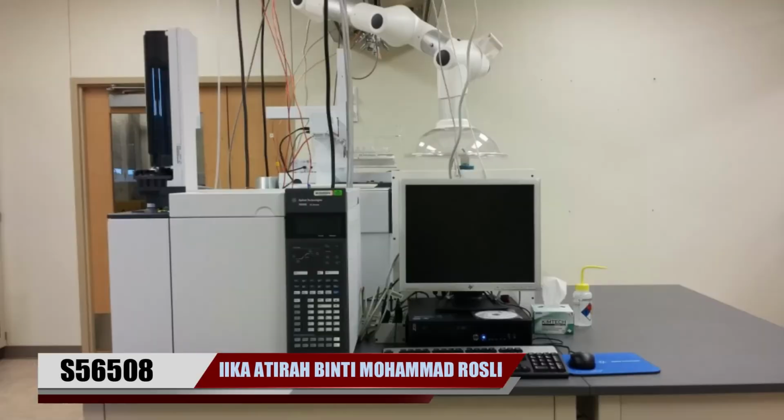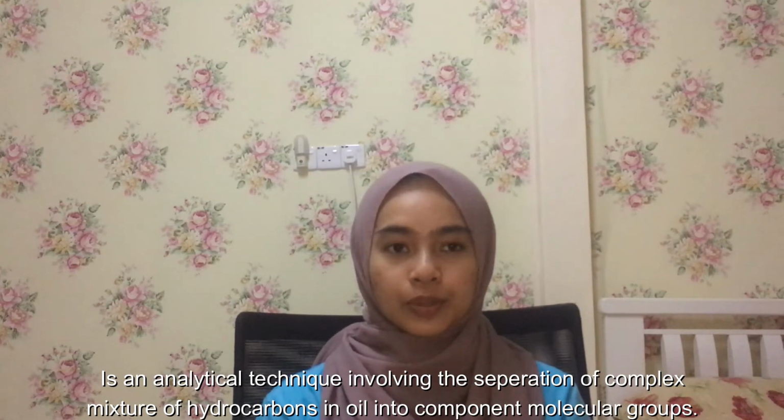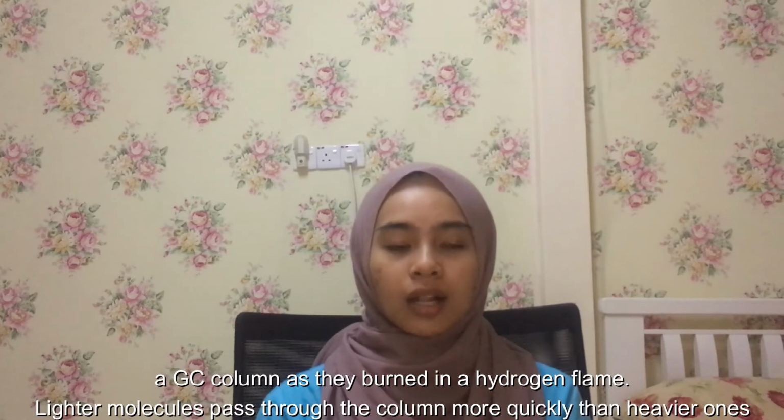Introduction to GC-FID. Gas chromatography is an analytical technique involving the separation of a complex mixture of hydrocarbons in oil into component molecular groups. A flame ionization detector, FID, is a sensor that responds to ion release from the combustion of molecules emitting from a GC column as they burn in a hydrogen flame.